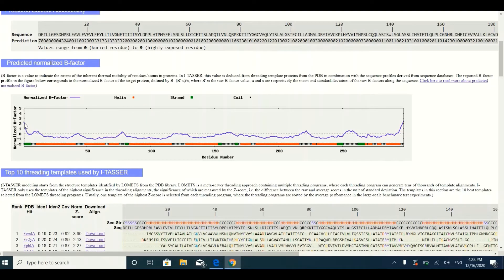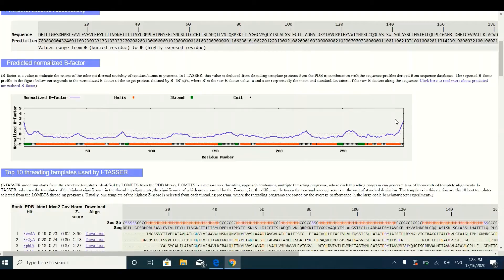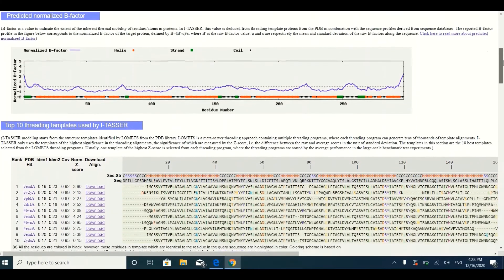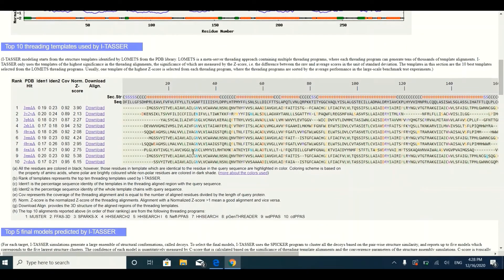If scores are above the zero dotted line, the amino acids are in flexible regions. For example, if the first few amino acids have a very high positive value, they are very flexible. Similarly, amino acids at the C-terminal with high positive values are also present in a very flexible region. After the B-factor section, you will find information about the templates.